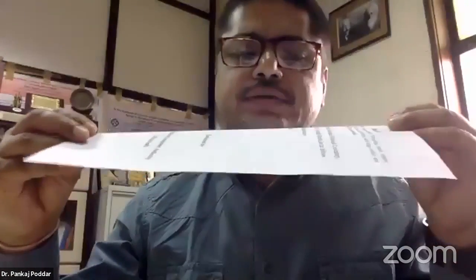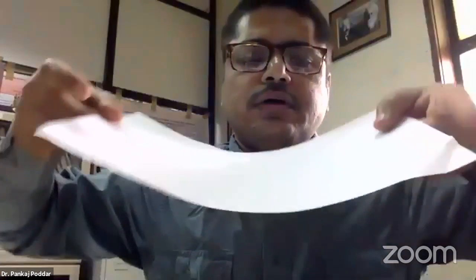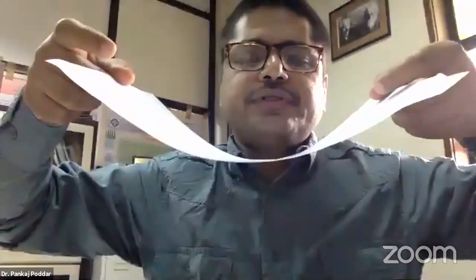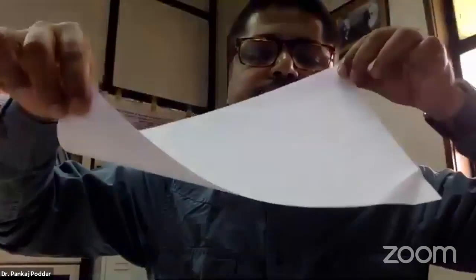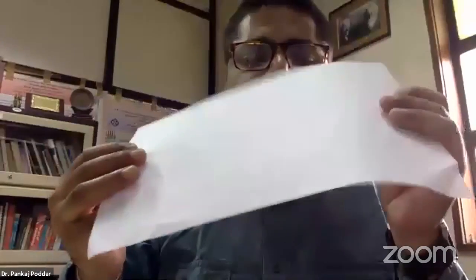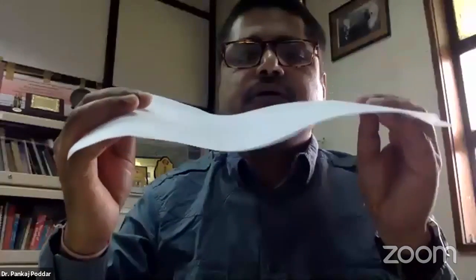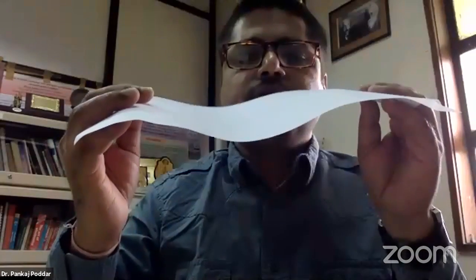Now you can see me holding the paper. Normally, suppose this is your paper. Even in atomic force microscopy, it's the same problem. When I teach AFM, I'll tell you how to make this into this. Usually samples are like this, or they can be like this, or like this, got it? Or they are curved like this, or wavy like this, got it? They can be like a wave, okay, but they are real-life samples, right?